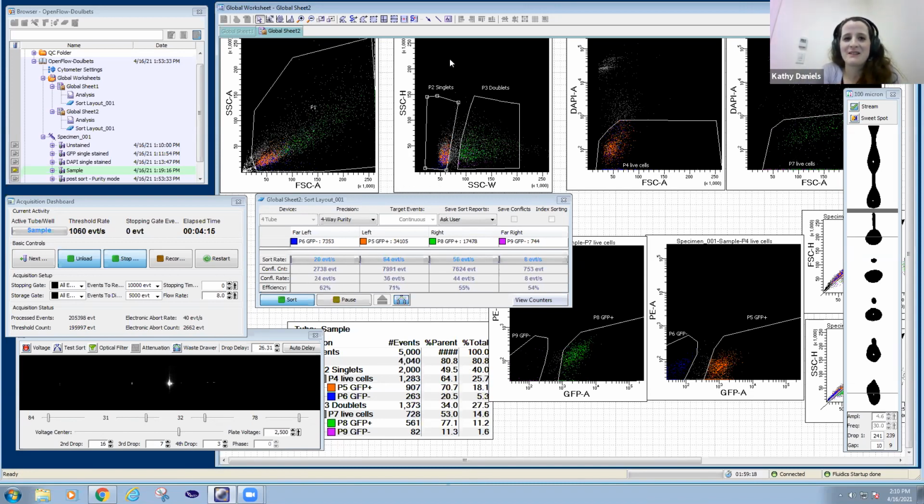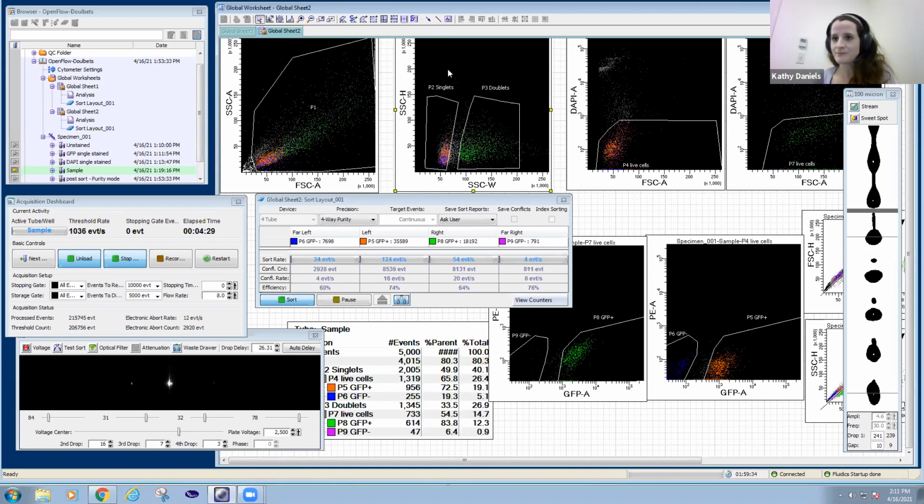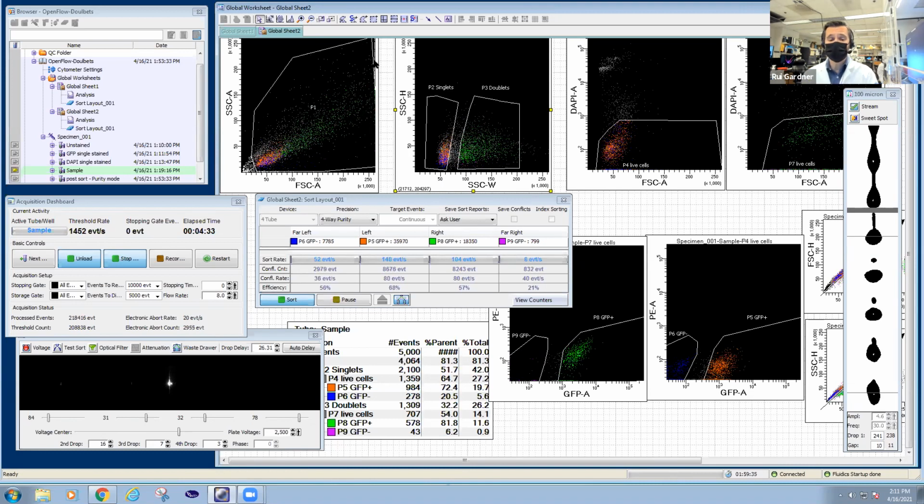Someone asked, is it okay to adjust that AccuDrop laser, the diode laser, during sorting? They thought it was adjusted for the AccuDrop calculation itself, and therefore should not be changed during a sort. Right. This is just a laser, so it's not measuring anything now. It's just for us to monitor the quality of what's sorting. You see that there's some fanning, especially in the ones being sorted at the far end.